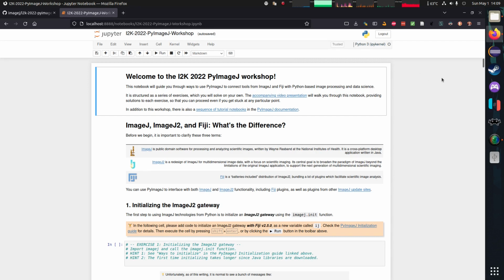It assumes that you know a little bit about quite a few things, but there are also links off to various other tutorials and notebooks to teach you about any areas that you might need to brush up on. And don't worry if you don't know anything, there are always links out, and I will be explaining a lot of different basics as succinctly as I can. This is a workshop focused on PyImageJ though, so that's where we'll spend most of our time, of course.